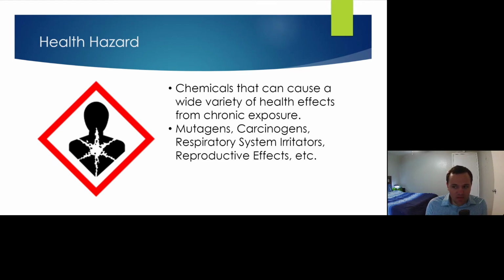They can be carcinogens. They can have an effect on your respiratory system, your reproductive system, all kinds of different problems that you honestly just don't want to deal with. So you've got to be careful if you're going to be using these over a long period of time, not to inhale or eat or drink or ingest or even have it come into contact with your skin over and over again, or it can cause some issues.